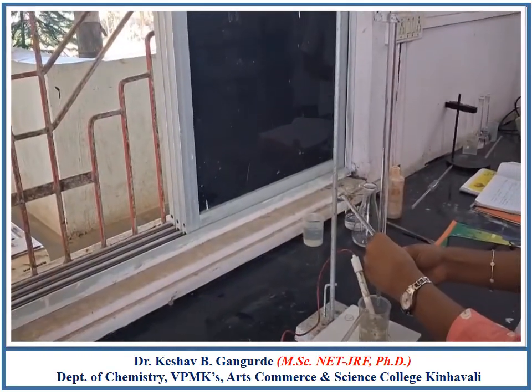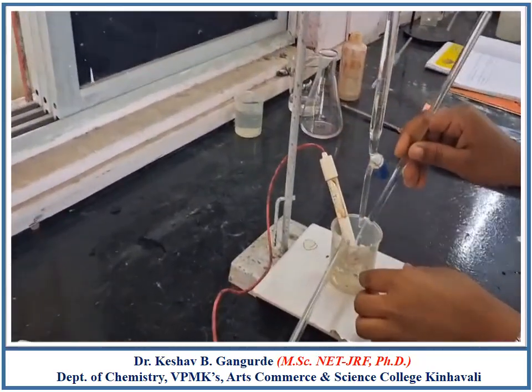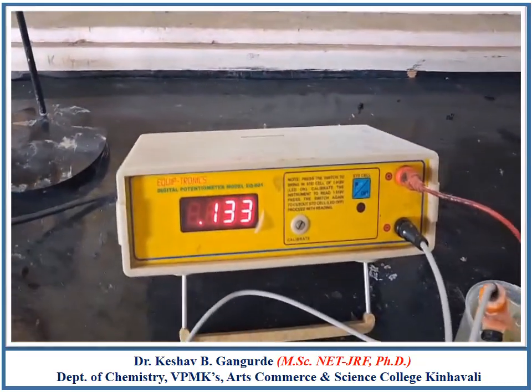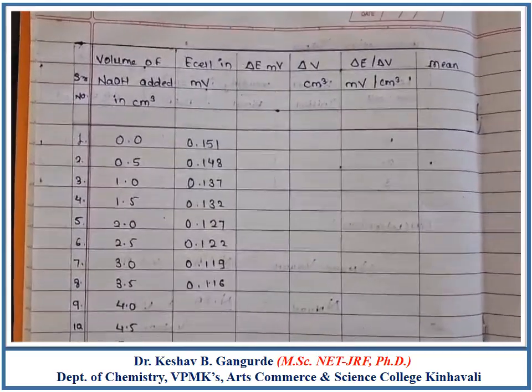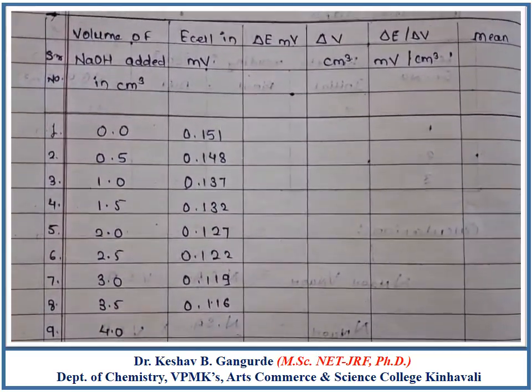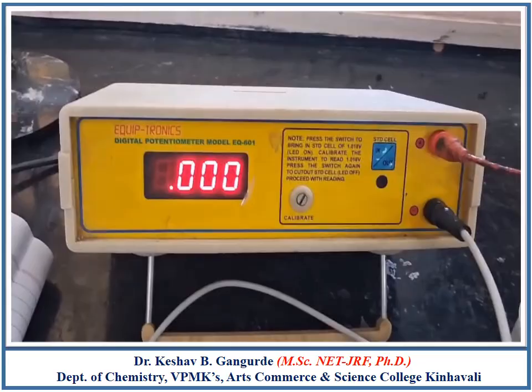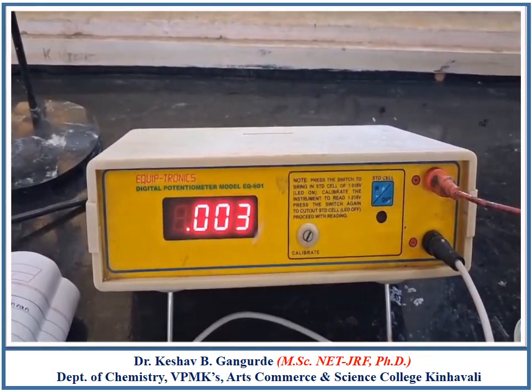Do the addition with 0.5 ml into the solution, stir it, and record the potential of the cell. For 3.5, the cell potential is 0.116 volt. Continue the titration till negative readings are observed. After getting negative readings, note down 5 more readings.